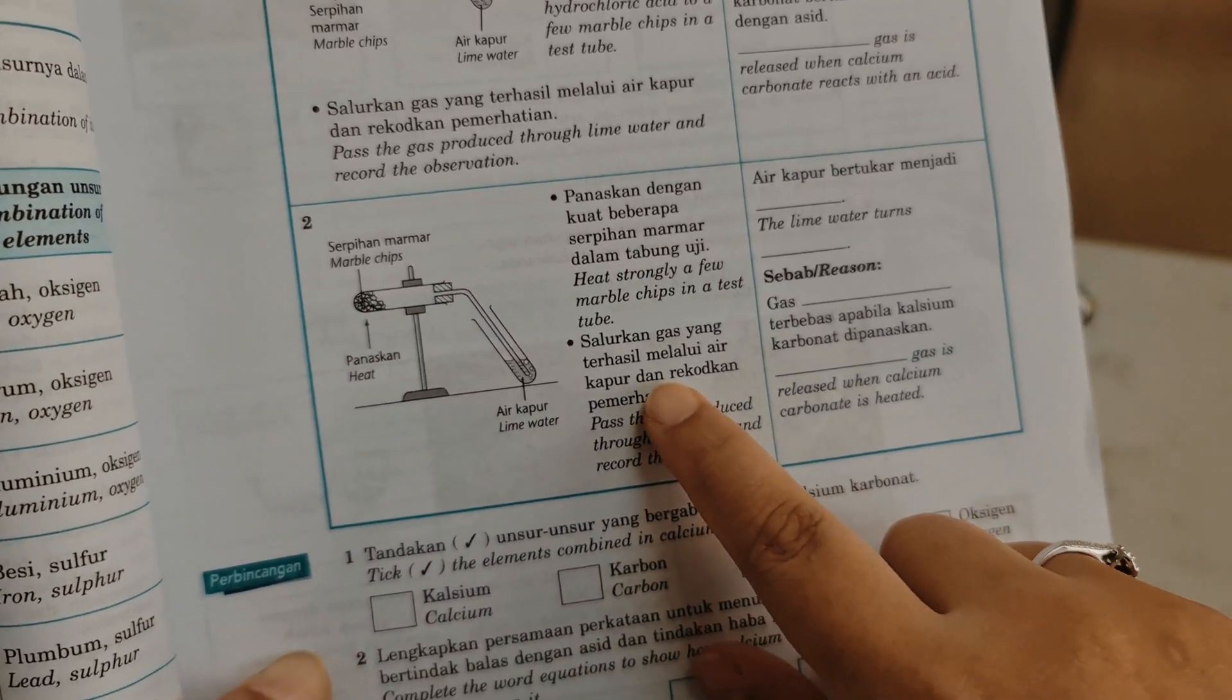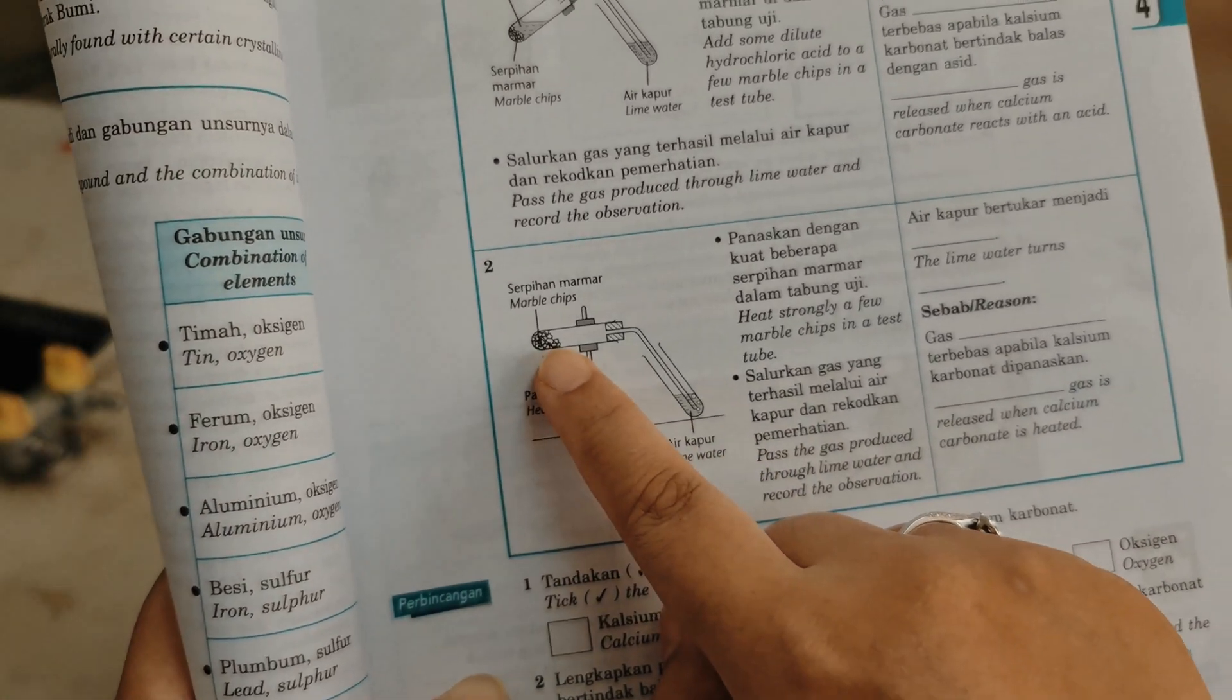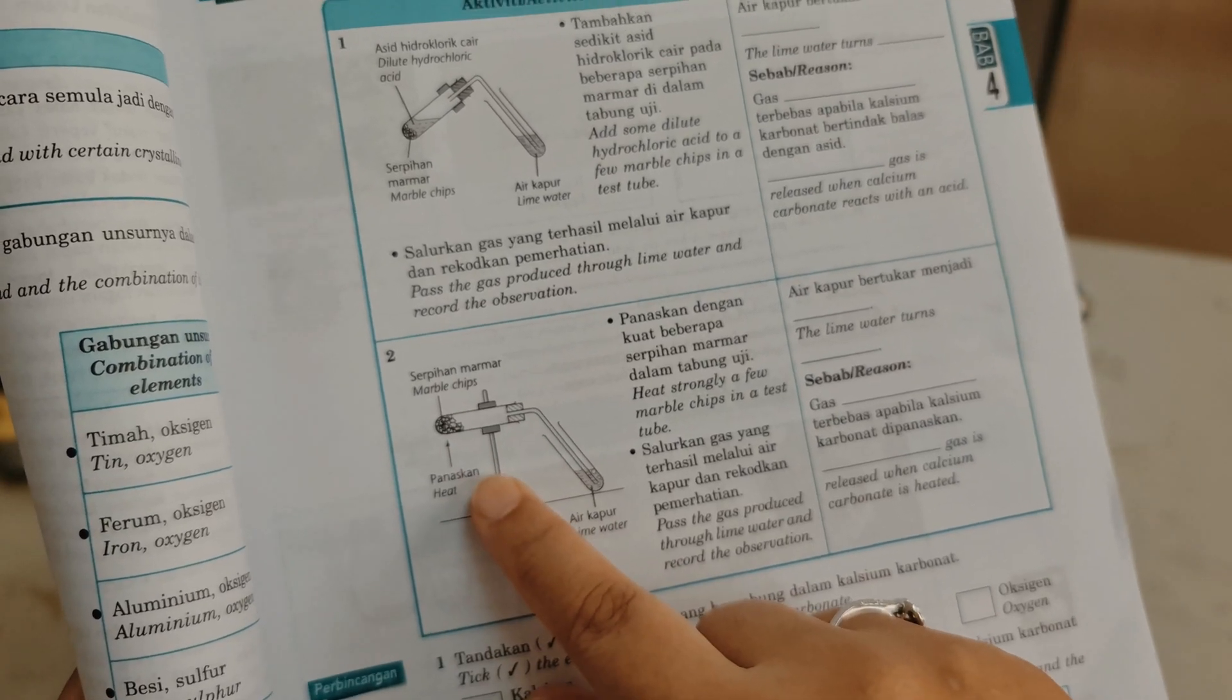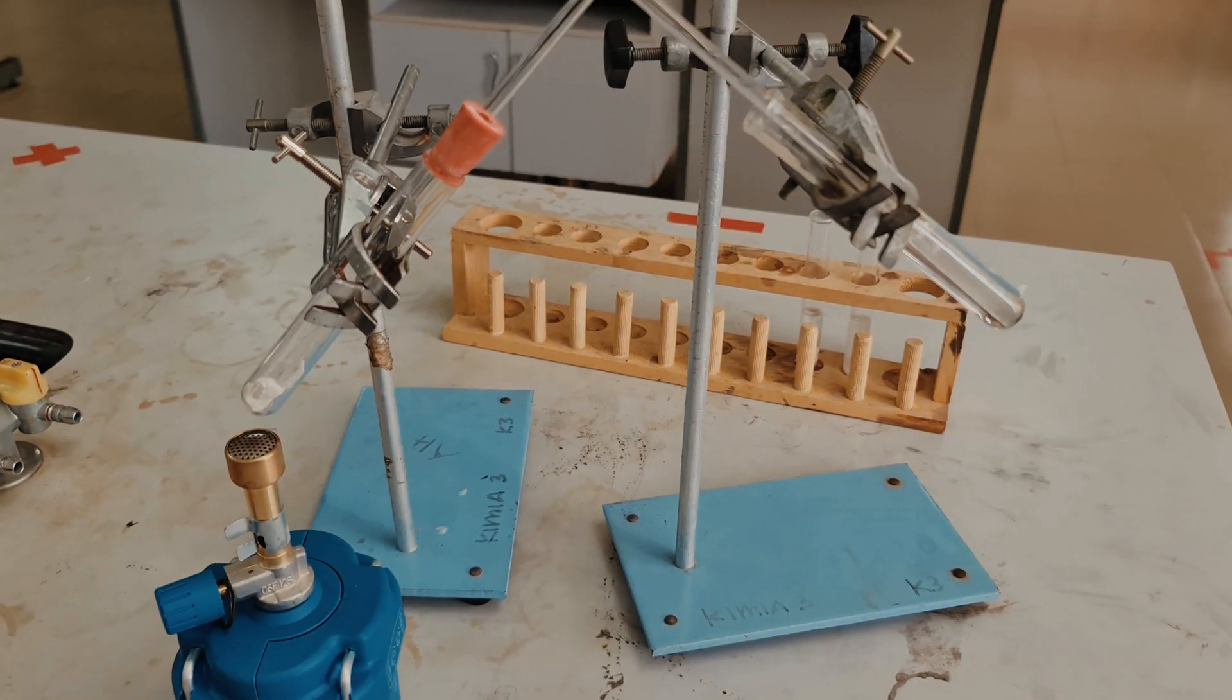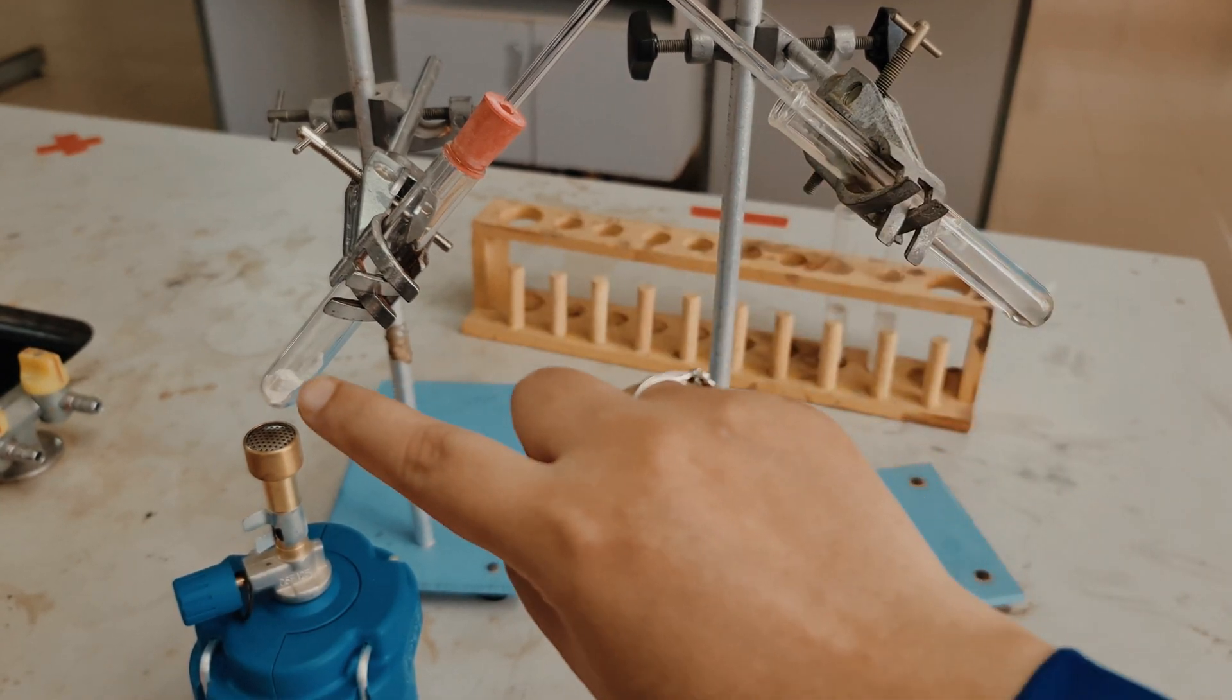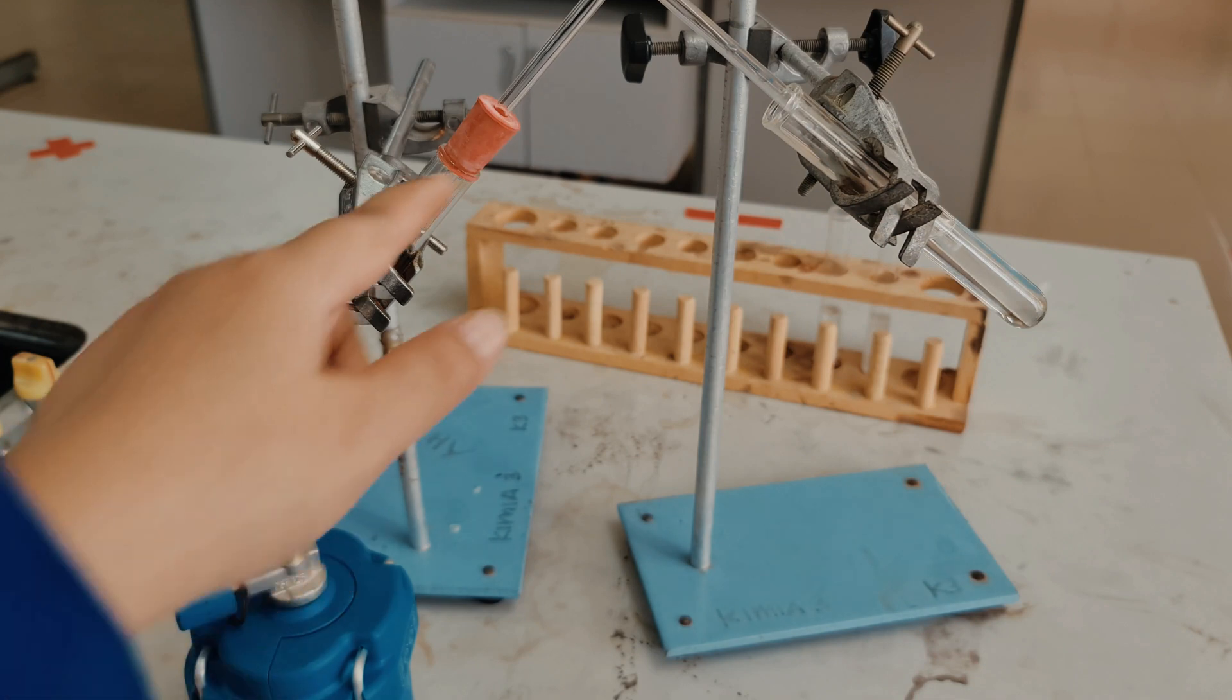For the second part, we are going to repeat the experiment by heating the marble chips. We are going to do the same setup as the previous one but this one without the acid. Okay, so I already did this and here I have the limewater and here I have the marble chips with the connecting tubes and the rubber stopper.